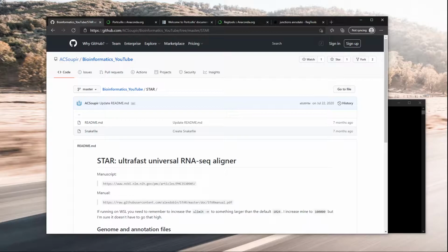Identifying new genes can help lead to new things like relationships between that new isoform and maybe a disease that is out there. So if there's a protein that is related or correlated with a disease, identifying that transcript can be beneficial. When looking around, I wasn't able to find something that was more step-by-step on how to perform this. It was more, okay, with STAR, it gives you a junction output. Okay, what can you do with that junction output? I couldn't really find anything as to what to do next.